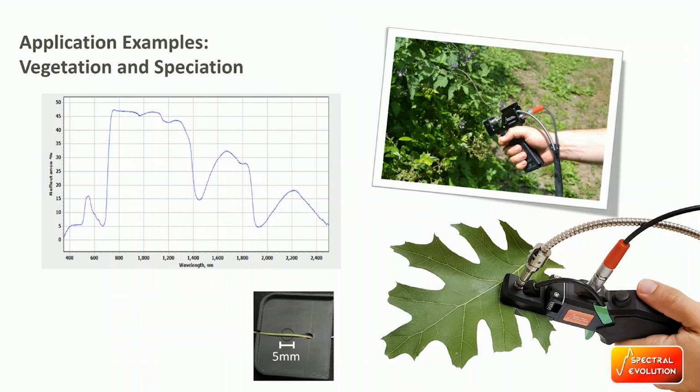So for even more targeted approaches, you can also use the pine needle adapter, which lets you get down to the millimeter scale or the pine needle scale reflectance measurements. But the leaf clip emphasizes the non-destructive nature of this sampling and makes sure that you can take continuous measurements on the same leaves without drying them out. So this is important for a lot of different plant nutrient metrics or plant health metrics or biodiversity as well.